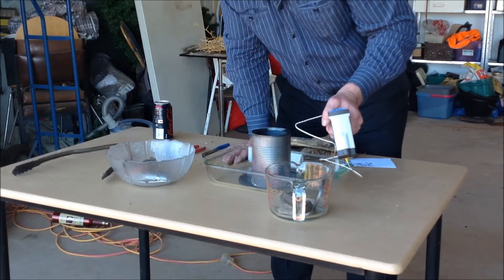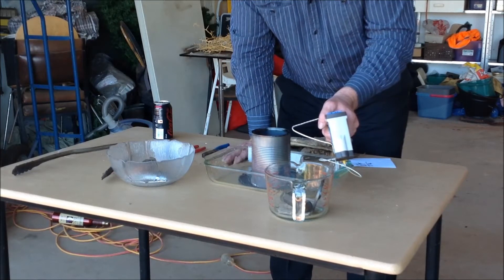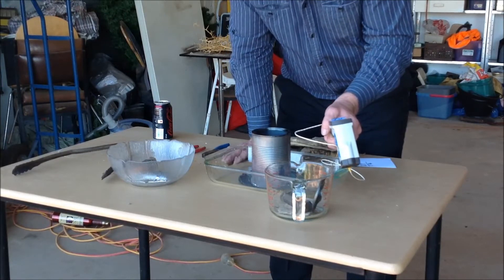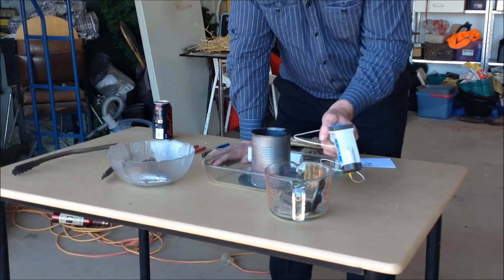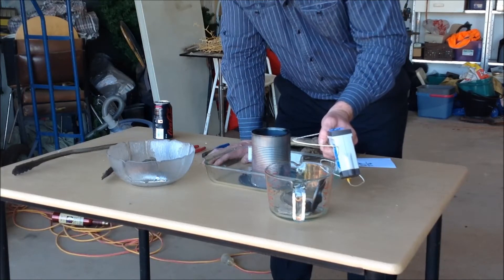470, 267.17. 460, 267.0. 450, 266.84. 440, 266.60.